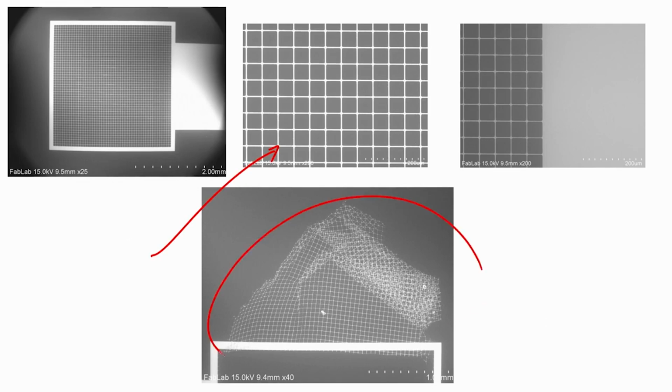Again this is because of skipping the process or not following the recipe correctly. We can see the micro grid detaching from the pad, right. This is a failure, but it should be like this, not like this. Okay. On this micro grid we place the tissue.